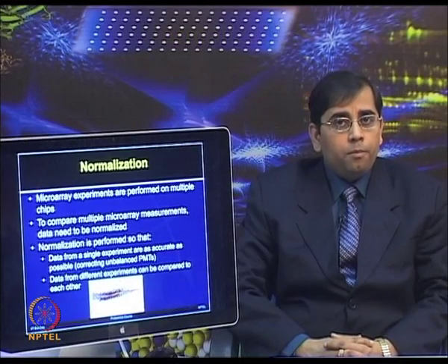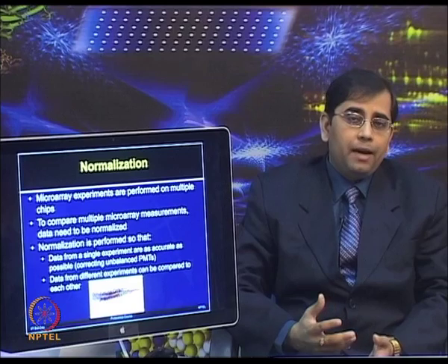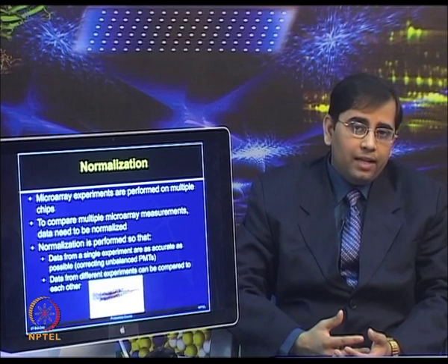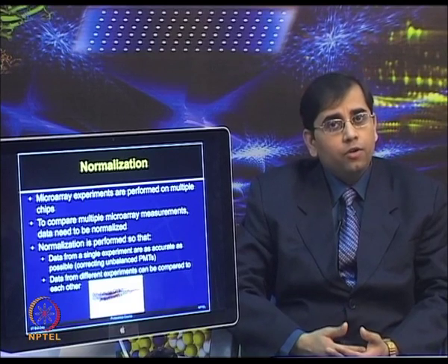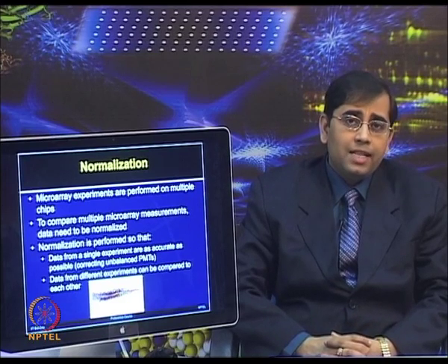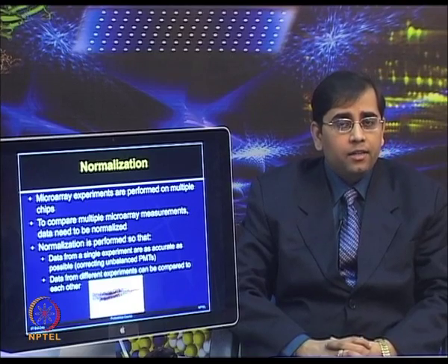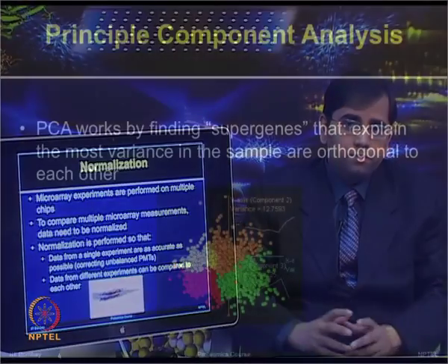It can be performed by adjusting various parameters as well as using the expression level of housekeeping genes. We will discuss these in more detail while looking at the software demonstration.